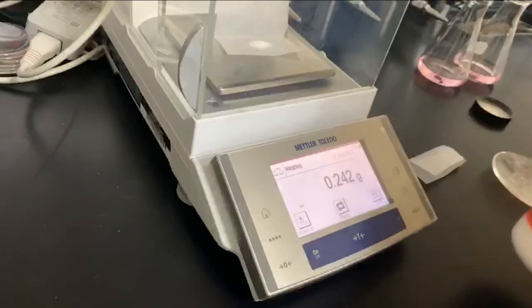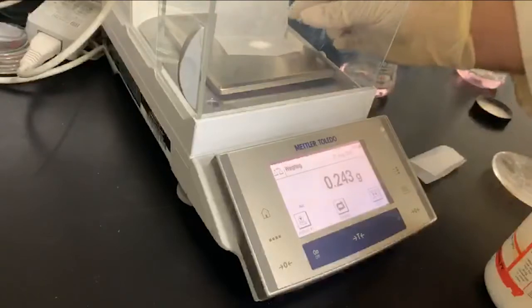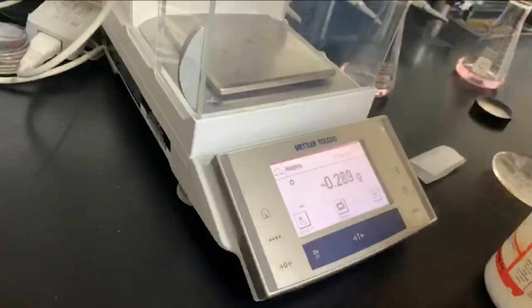We're going to call that good. All right, so that's our first sample. I'm going to put that in the Erlenmeyer flask that's labeled B, because that makes sense.